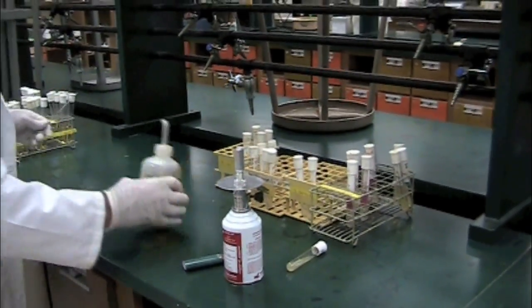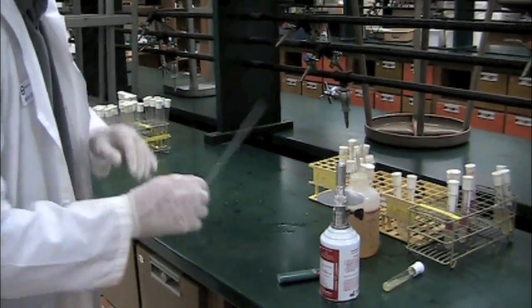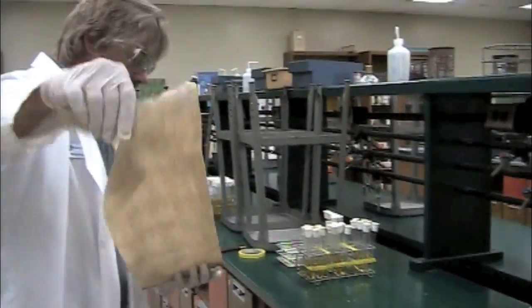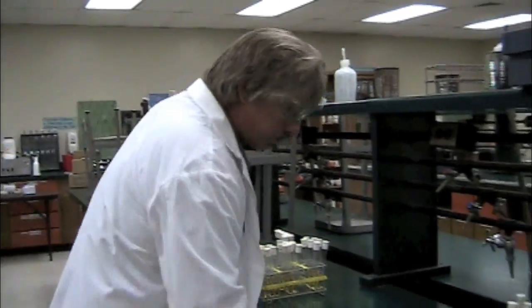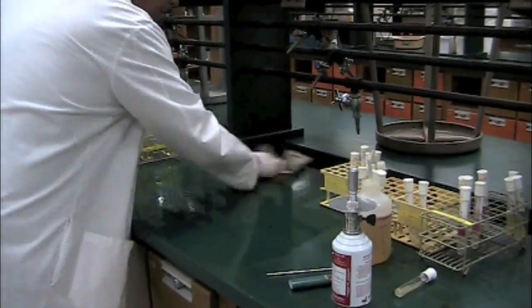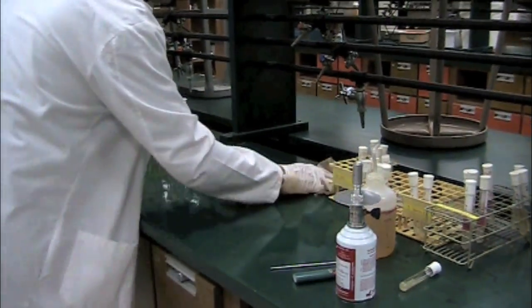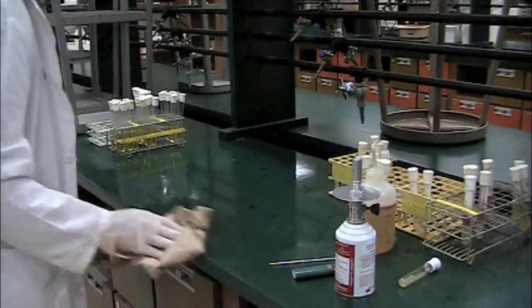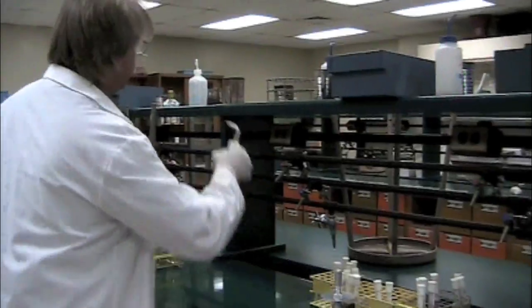The first thing that you've got to do is disinfect your bench. Okay? Disinfect your bench. And in microbiology, we understand that disinfectants work best whenever they're left on the organism for as long as possible. So you're going to notice that I'm wiping the disinfectant around the bench, but I'm not going to dry it. I'm going to leave it just like that and work on top of it. It's okay to continue working after it dries, but you want the wet disinfectant on the bacteria as long as possible. That's what kills them, okay?